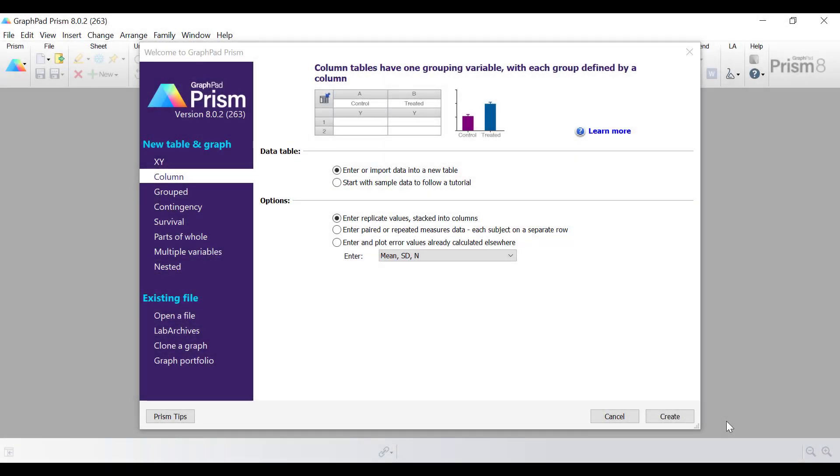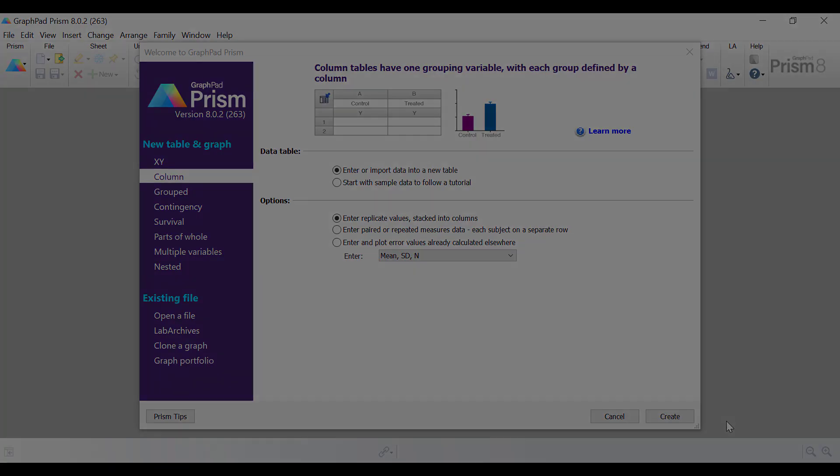In this video I'm going to show you how to log transform data by using GraphPad.